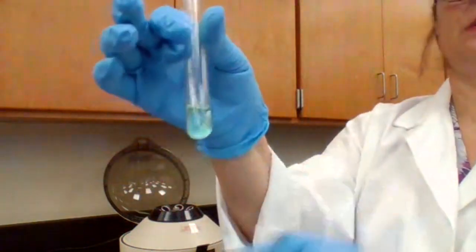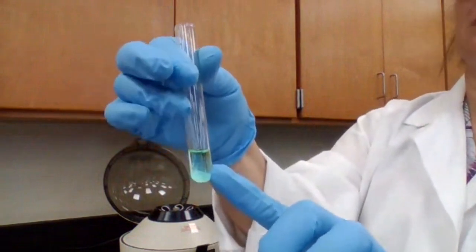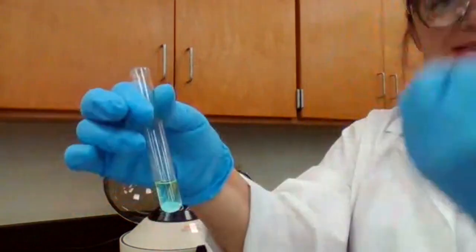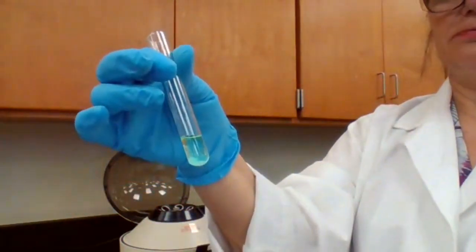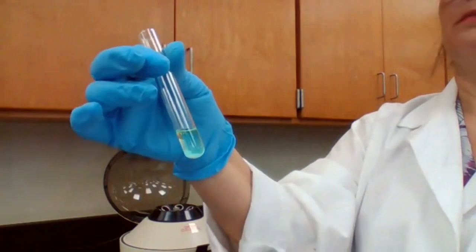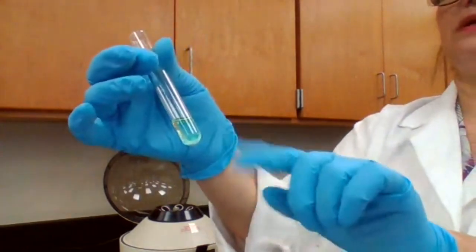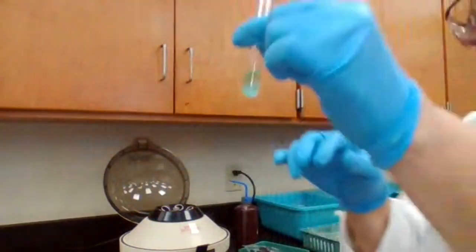In the solution part, there is no silver or lead. If I got additional precipitate, what I do is put it back in the centrifuge and separate, making sure that the white precipitate is settled down completely and only the clear liquid is on top. So no new precipitate forms.